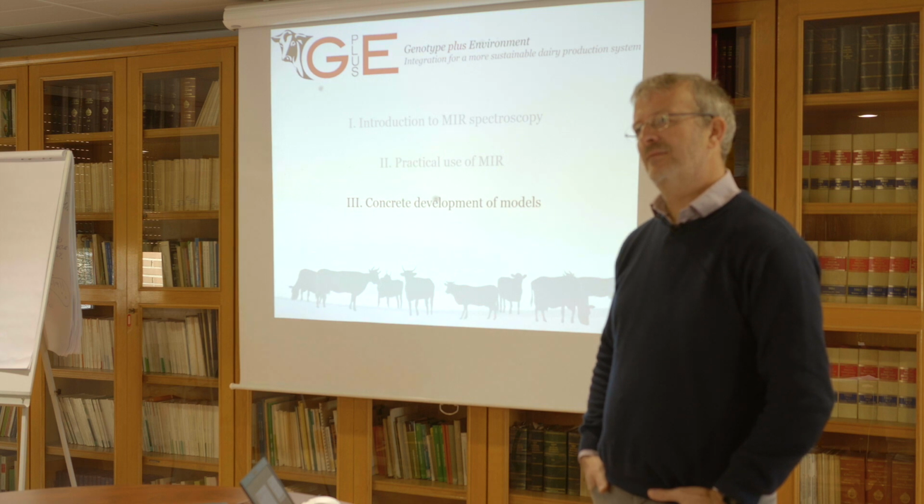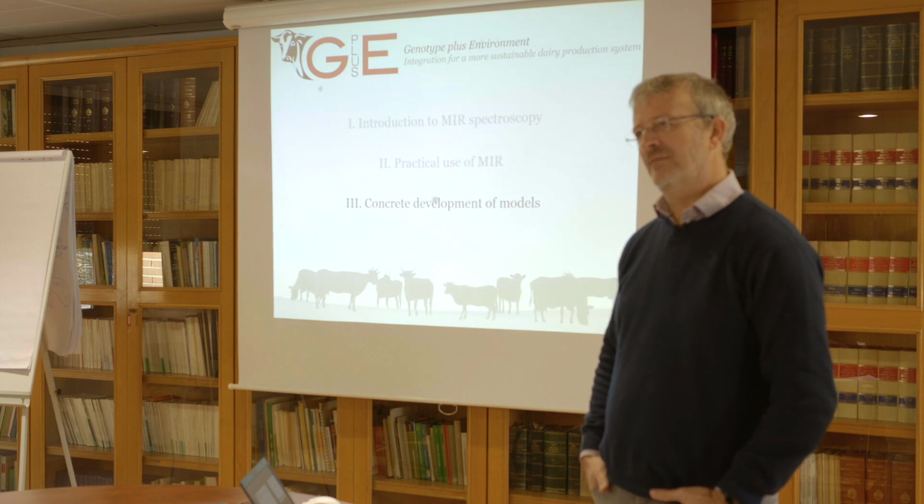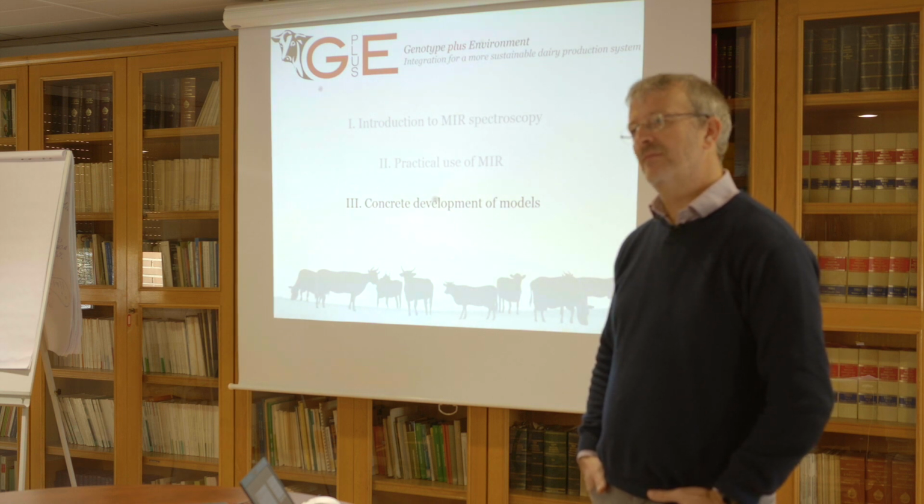Thank you very much. If you calibrate the equipment in the master collection, because if I understand what you explained, your calibration for all the between labs, it's only valid for a particular moment, no? Because if the conditions of the equipment in the master collection change over time, calibrations will be different. Yes. Calibrate over time. Yes.